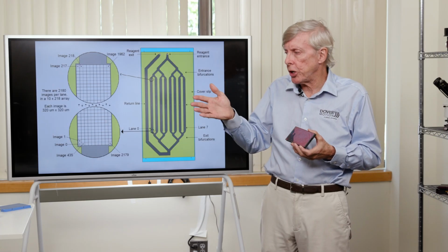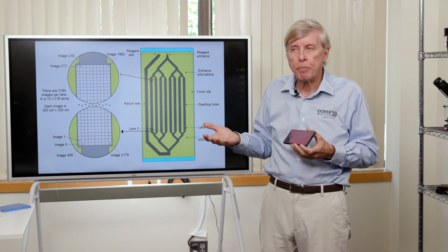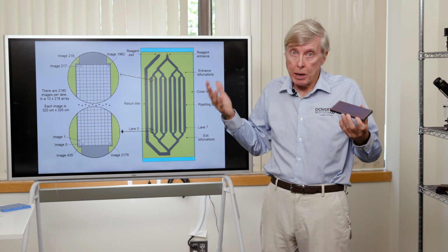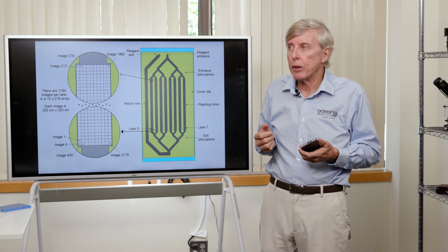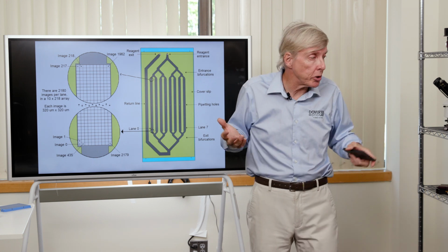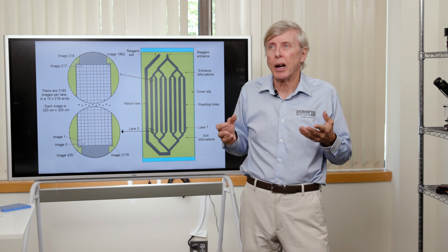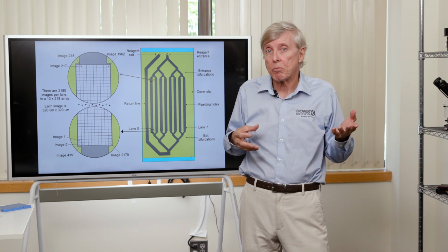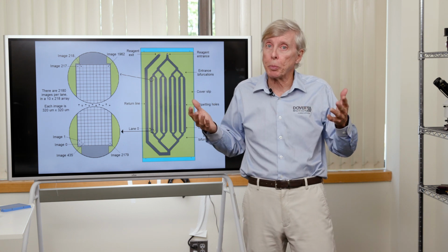The smart stage XY that we showed earlier is a direct drive stage. And that is the highest performance way to get linear motion. Another approach would be to use a lead screw or a ball screw. That could be activated by a rotary motor, could be a brushless motor with a rotary encoder, could be a stepping motor open loop.